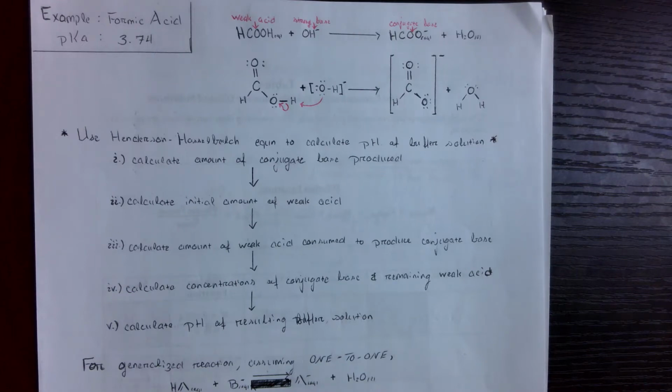Calculating the pH for a buffer solution is not a hard thing, but I find that it's often presented in a really unclear and confusing way. When I had to start teaching this lab, it had been years since I had done acid base calculations, and I had to reteach myself, and I was appalled at how bad a lot of people's lecture notes on this stuff are.